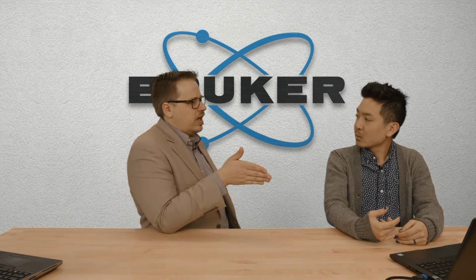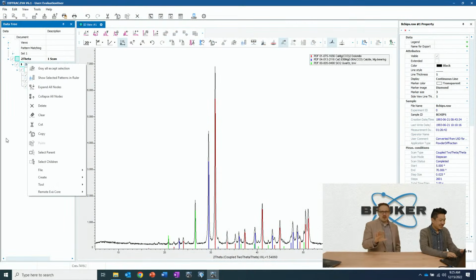But there's also a tool I know called Automatch. And so it kind of does this, right? Yeah. So can we try it? We can try it. I'm giving Nate a challenge here. So if it doesn't work, this is all on me.